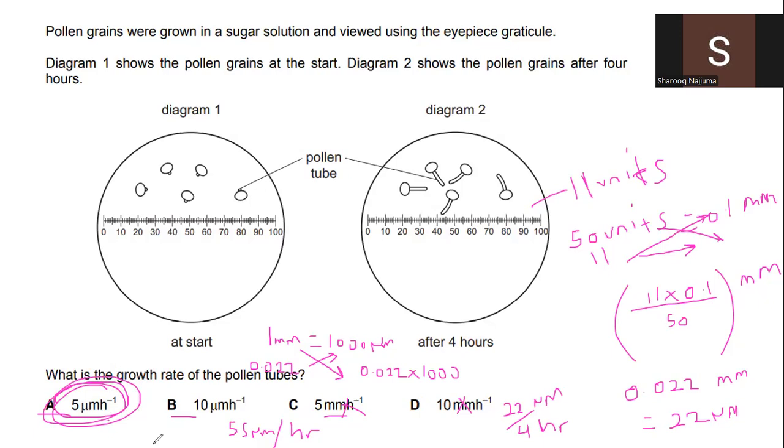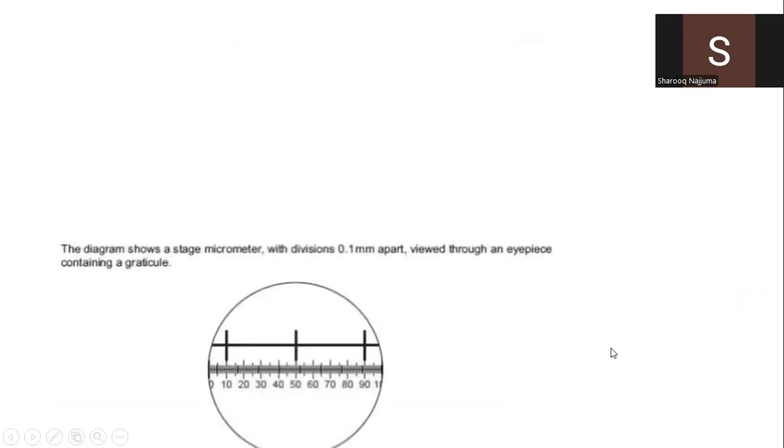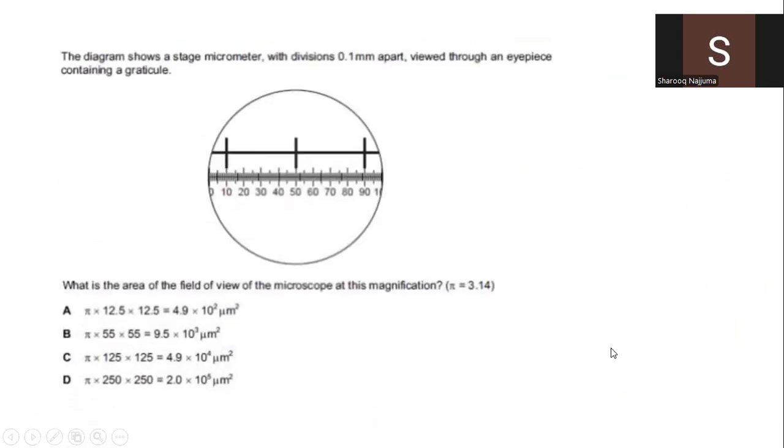So that is how we use an eyepiece graticule. This knowledge is very important for your practicals and your other questions that you find in either the multiple choice or the structured paper.